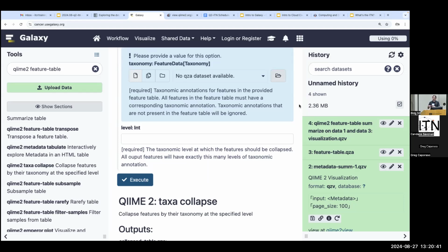By nature of it being a zip, we essentially wanted this to be what we would call future proof. Let's say it's 10 years down the road, and I hope this isn't the case, but let's just say nobody's using QIIME2 anymore. But you come across one of these artifacts because you downloaded some supplementary material from a paper.